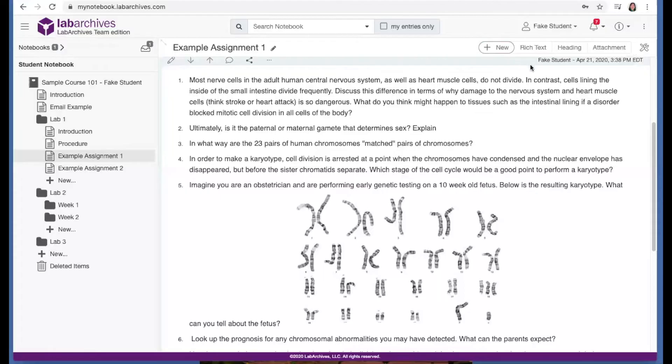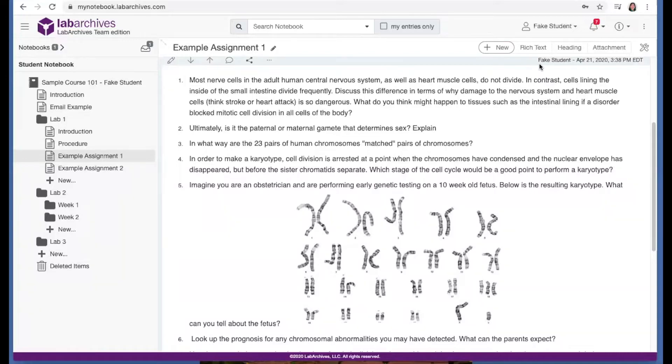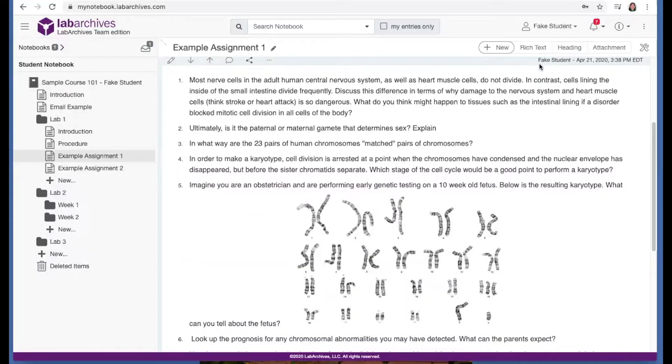Now as you can see at the top right-hand side of every entry, you see a timestamp. This indicates the most recent change made to that entry. Every action that you take in your lab notebook is recorded in the LabArchives revisions history. If you accidentally delete or change part of your notebook, you can always recover that data.